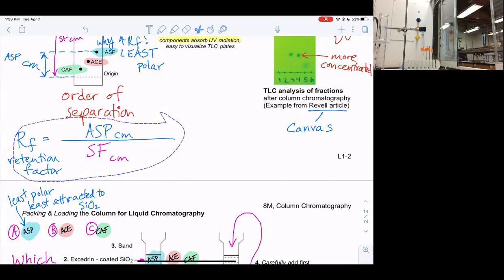Yeah, so now we're at the 1-2. It takes a while for all of the 1-2, the next solvent gradient, for that to really bleed through.